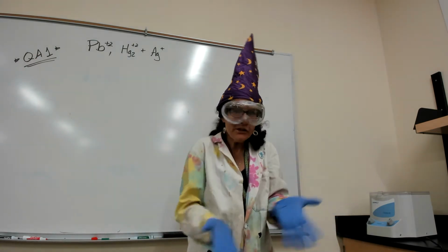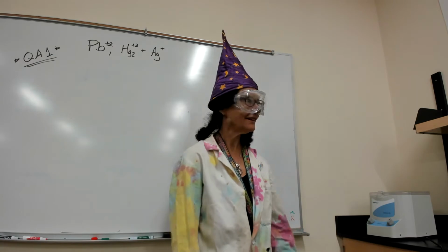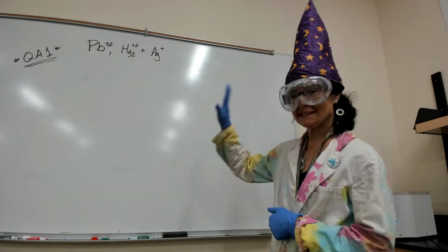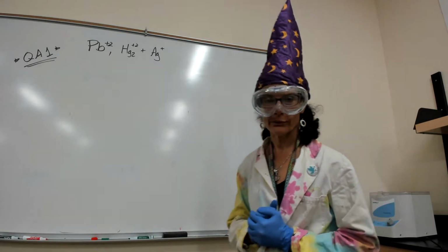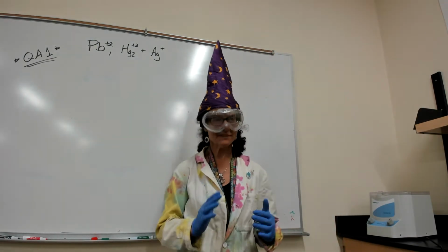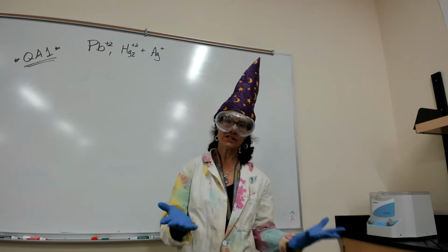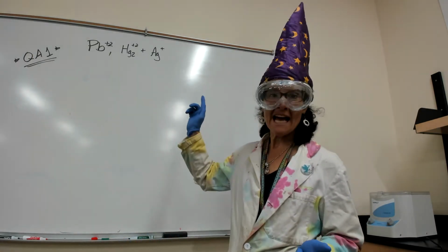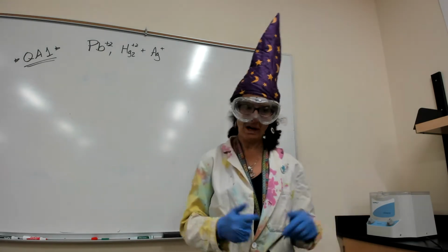Carlos and Ryan, I'm at your lab bench from 221. So look familiar? I'm at their lab bench because it has the board, and I'm going to walk through QA1 with you. It's a pretty simple lab, and from reading this, you'll be able to answer the post-lab questions, and then you're going to make a flow chart. So we're going to walk through that.